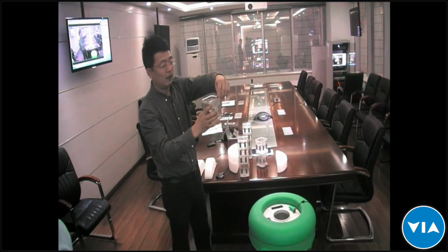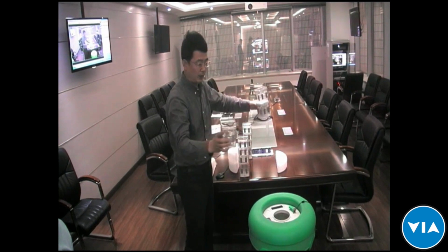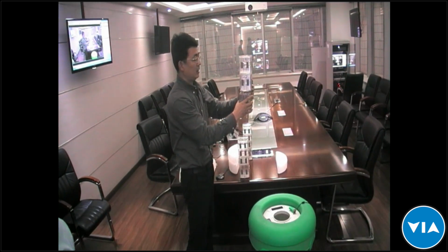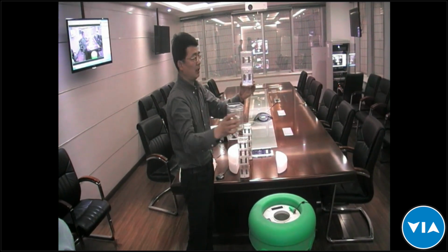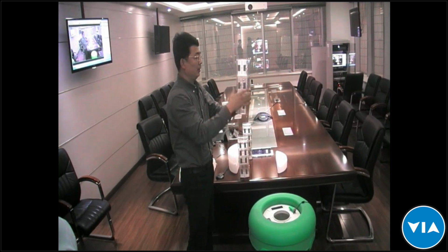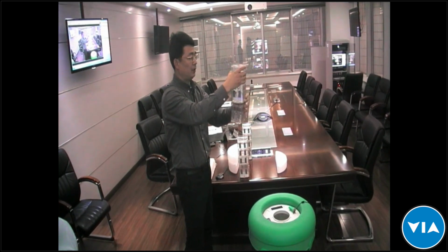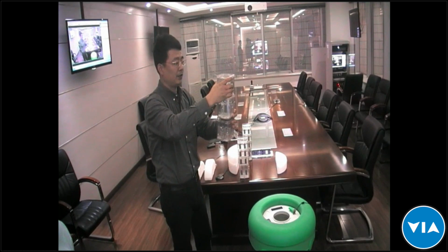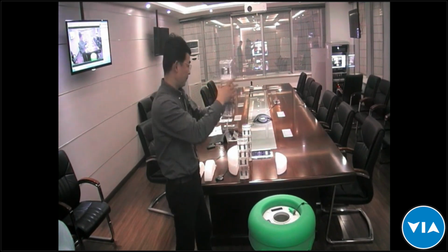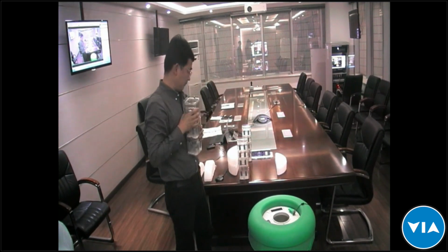And after the vaccine is taken out, you can put this cup on the bottom over here. That means this cup of vaccine is used, and you can twist this cup apart, and after using the vaccine, you can put this cup to the bottom, and so it cycles. Okay, this is the middle one.